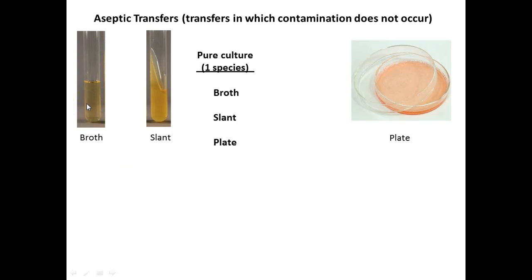They would be happiest if we had what's referred to as a shaker. In one of the labs I worked in, you literally opened up the incubator and there was this big wheel that had all these holes in it for the tubes, and it spun, right? This moved the media around for those that weren't motile, so they weren't stuck in their own swill, their own waste, all the time. They were getting fresh nutrients for part of the time. We don't have that type of equipment here, right?